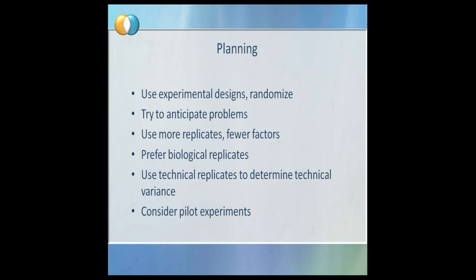Buffer is maybe finished during the project, so you should have enough at hand. Maybe if you run multiplex experiments using an internal standard, the standard mixture might not be sufficient and run out during your project. So you should be aware of possible problems that might arise, and some will arise during your project.